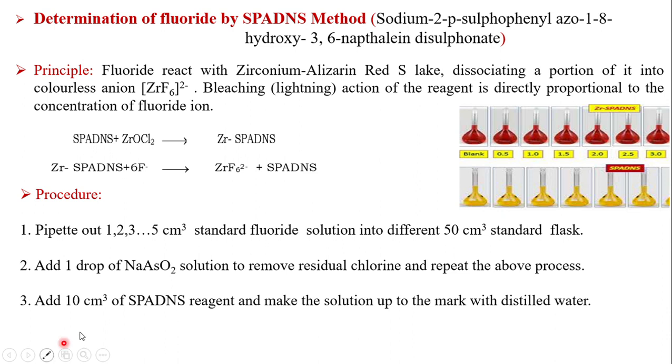For that, we need a standard called sodium fluoride standard solution. That is prepared by weighing 0.221 gram of sodium fluoride.